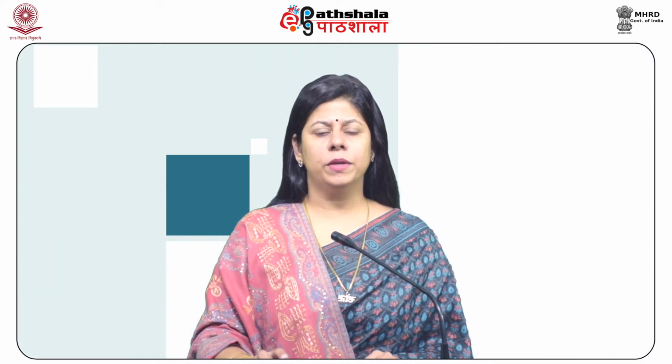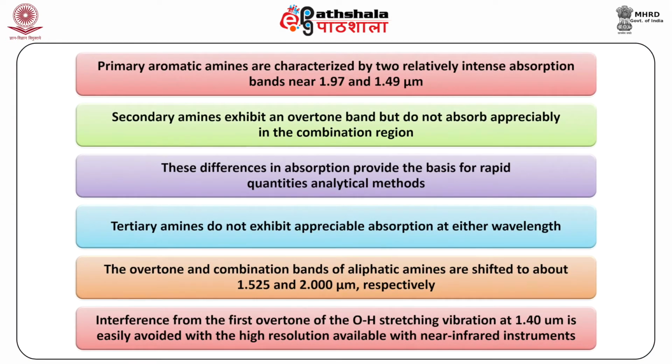Near infrared spectrometry is a valuable tool for analyzing mixtures of aromatic amines. Primary aromatic amines are characterized by two relatively intense absorption bands near 1.97 and 1.49 micrometer. Secondary amines exhibit an overtone band but do not absorb appreciably in the combination region. These differences in absorption provide the basis for rapid quantitative analytical methods. Tertiary amines do not exhibit appreciable absorption at either wavelength.